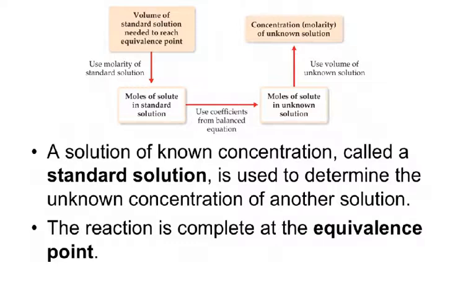If you look here, the known solution which goes in the burette, known as the titrant, is called a standard solution, and we're going to use that standard to determine the unknown concentration of the solution inside the Erlenmeyer flask. That solution, again, is called the analyte.